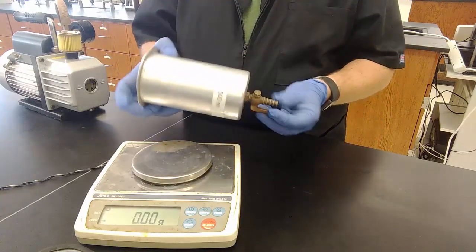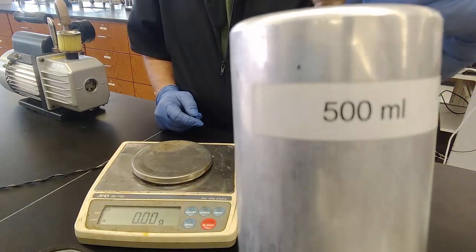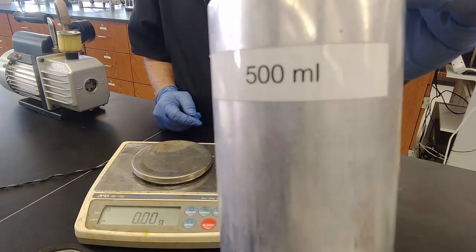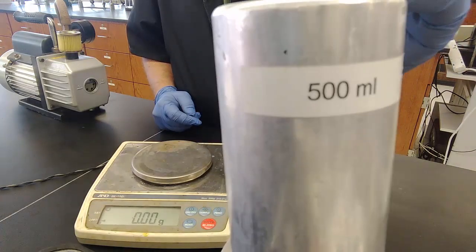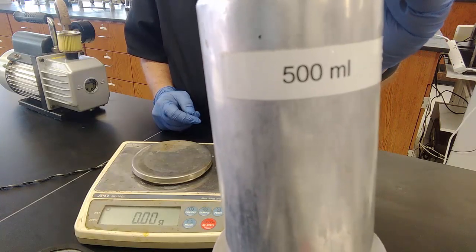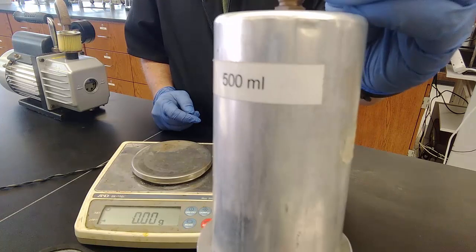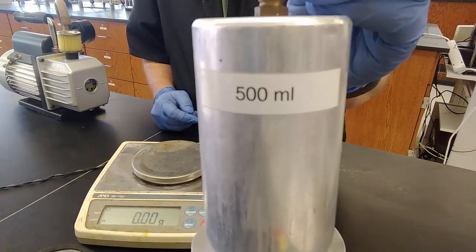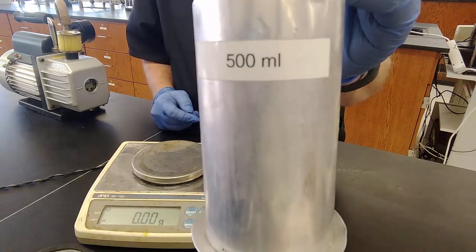So to do that, I got this densitometer here. This densitometer holds 500 milliliters. That L should be a capital L, but it's not. Milliliters, capital L is for liters, and M is for milli. So 500 one-thousandths of a liter. So this is 500 out of 1,000, half of a liter. 0.500 liters. Okay?